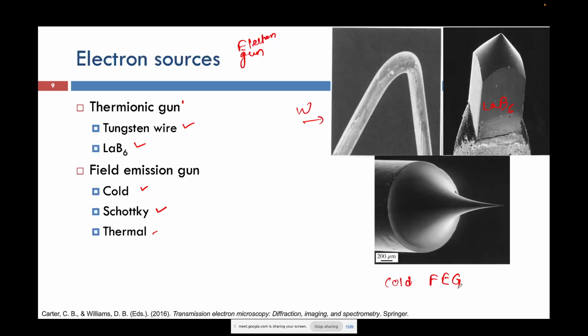So what is the mechanism behind this electron emission from the electron gun? Generally, if we heat any material, let's say I am taking a material M, and we heat it beyond a certain temperature, the electrons and light particles both will start coming out. So what is that temperature? That temperature is 2700 Kelvin. If we heat any material beyond 2700 Kelvin, both light as well as electrons will start coming from that material.